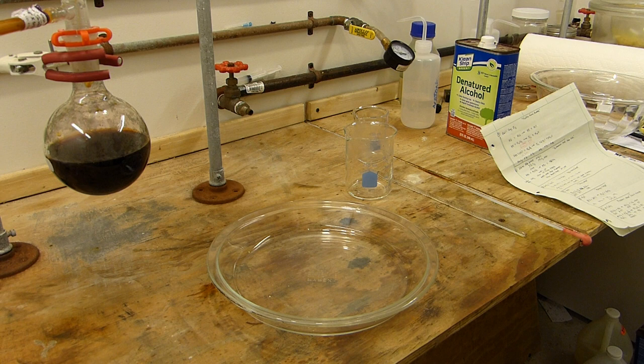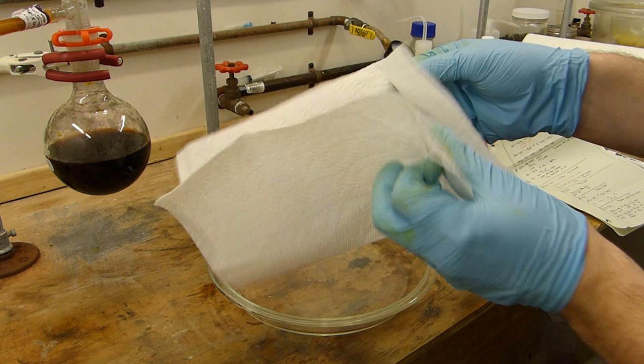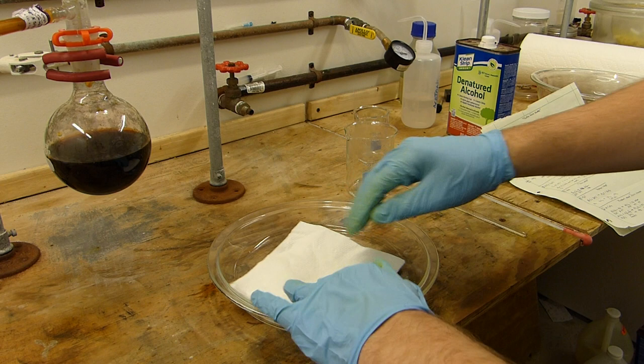While I continue to pull a vacuum on that we'll set up a small drying pad. I've done this in previous videos but I guess I'll show you some specifics. It's just some paper towels. Fold it in fours.